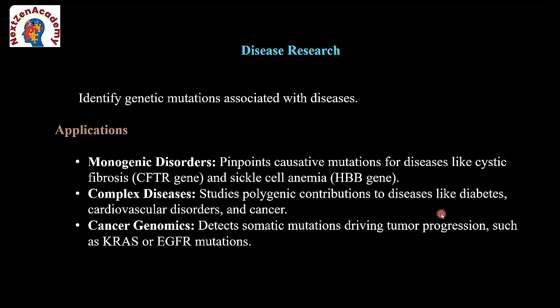What do we mean by SNP? SNP is a single nucleotide polymorphism, the change of only one nucleotide. Similarly, in the reference position, the sample reads have changed into C. You can see the single nucleotide changed in multiple samples. That is telling us it is a single nucleotide polymorphism. That is a SNP, the first and foremost genetic variation.